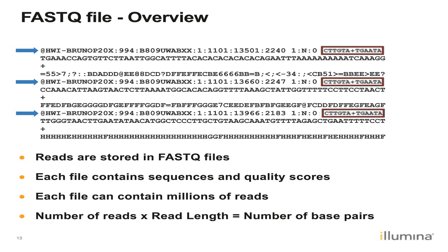The next line contains your actual read, or the genomic information that was read from the sequencer, and basically what we're going to use as input to everything else. There is a plus in between the read sequence and this last line here, which is your Q score, your quality score. This line is ASCII encoded, so these characters correspond to an ASCII number that will then give you your Q score. Typically, we look for Q scores for the base calls higher than 30, but there are occasions when we have lower, and that might still be okay.